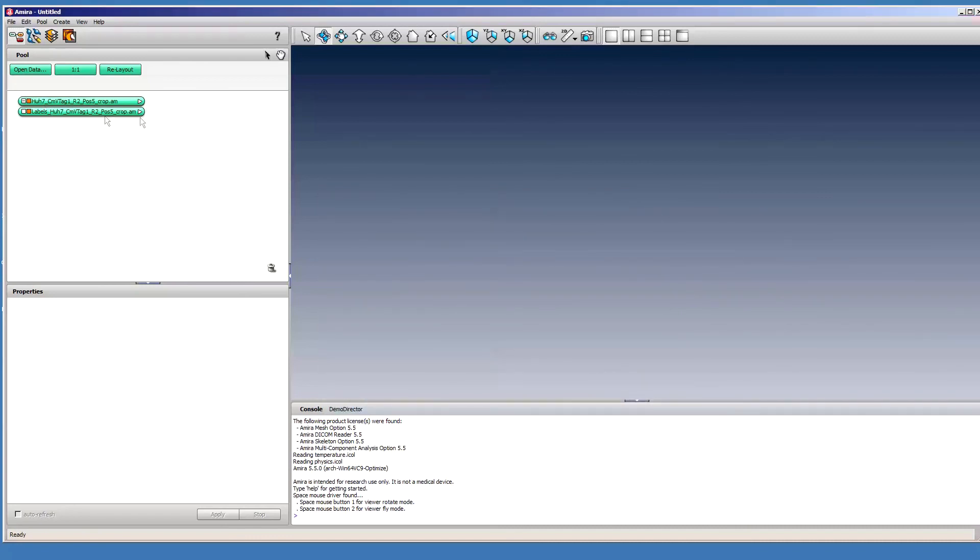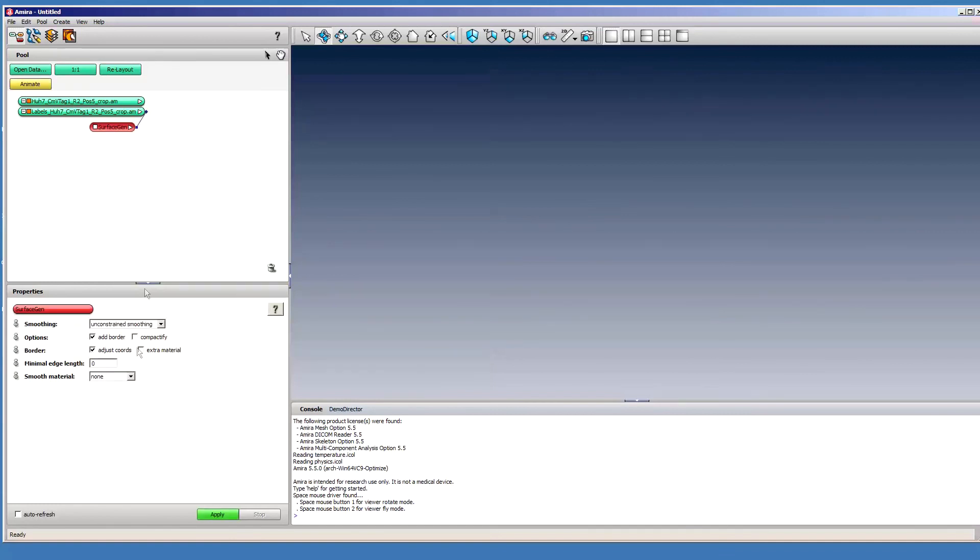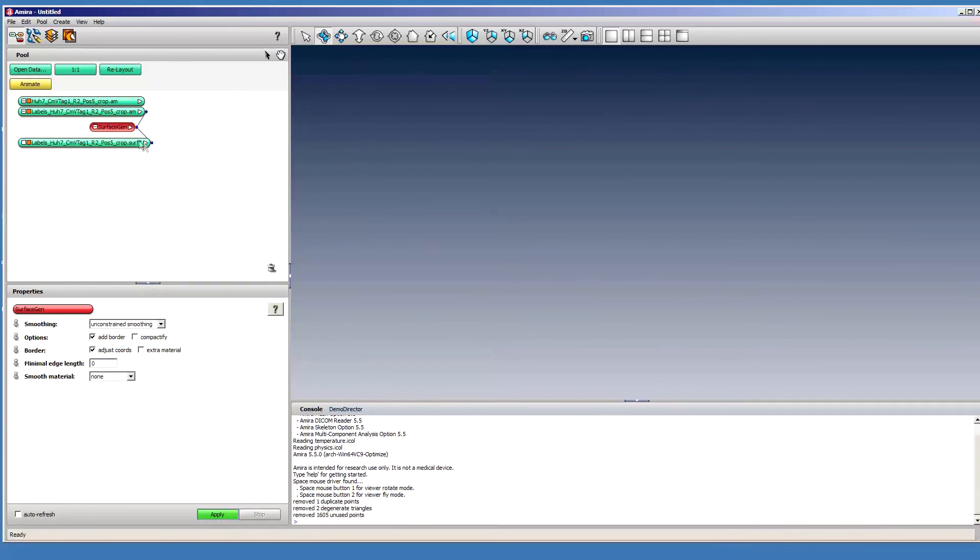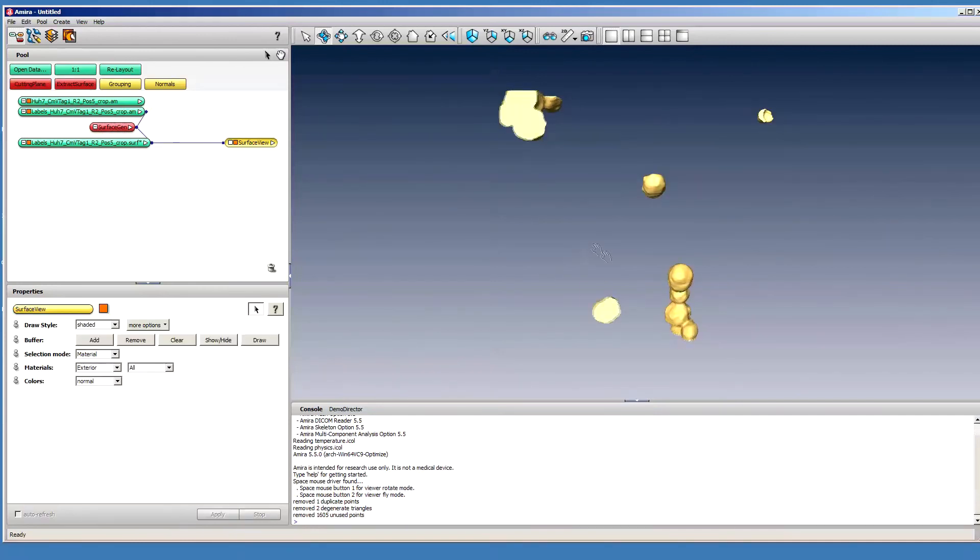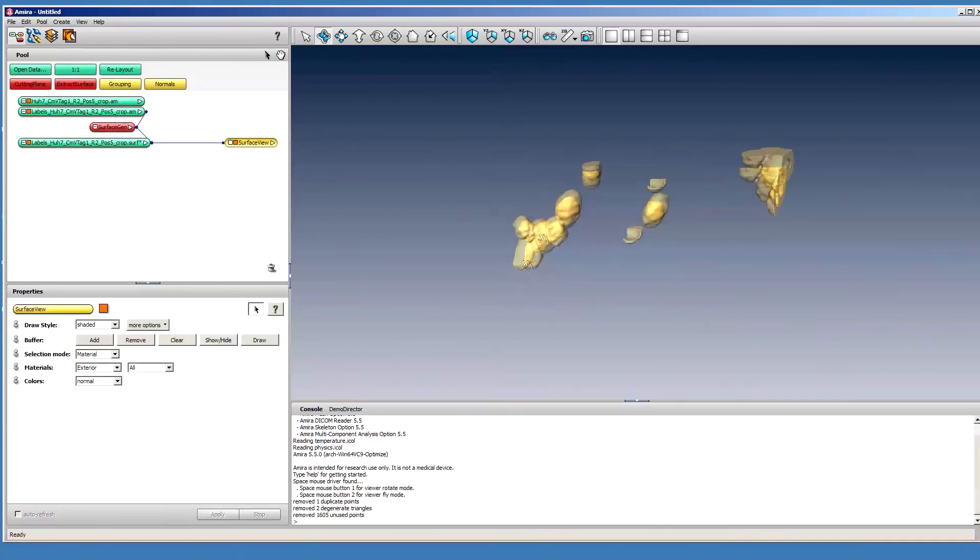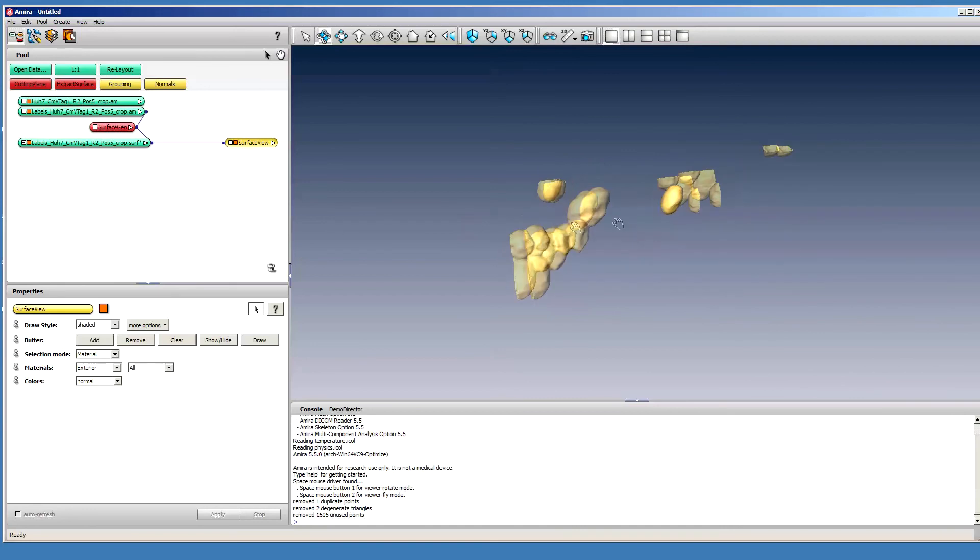We'll connect this here and then make surface gen. Okay. And then this is the lipid droplets that we just segmented.